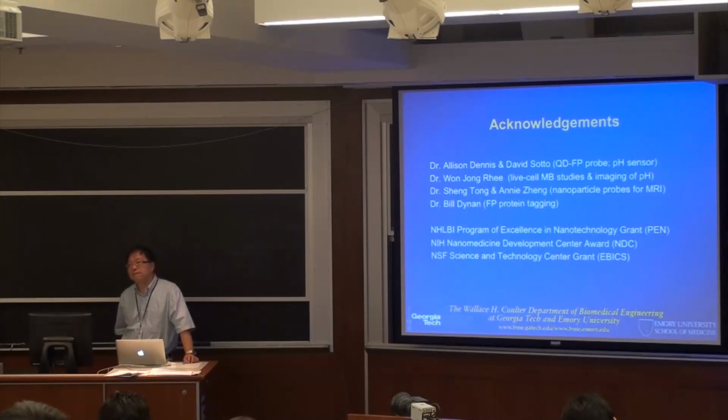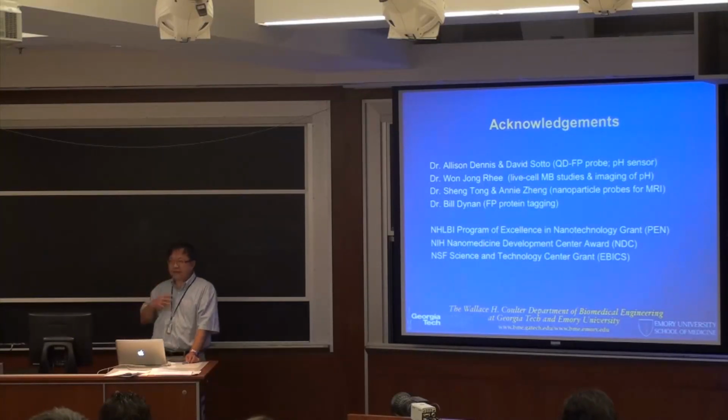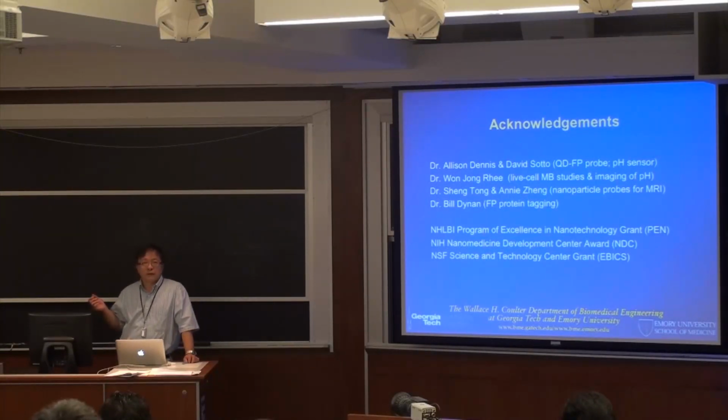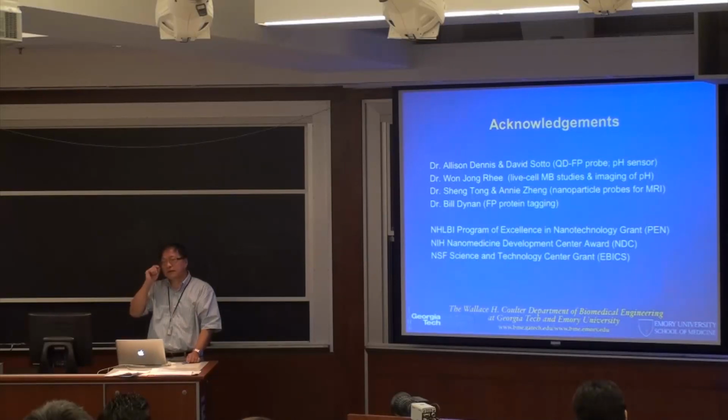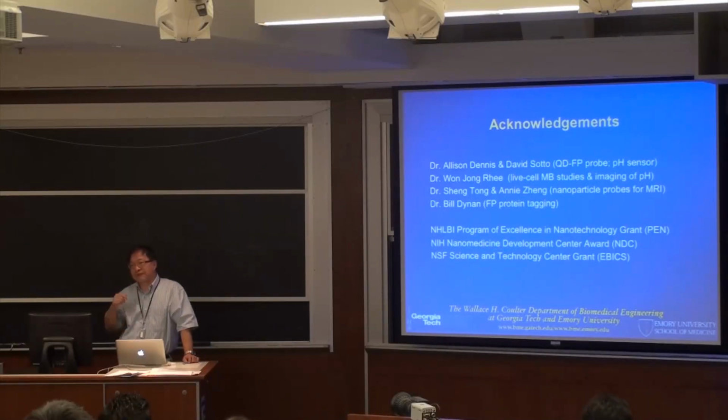Can you do things like alter the exposure time? Yeah, you can use all kinds of tricks optically. For example, some of the microscopes, like the one we use, called DeltaVision, has a very nice engineering to coordinate exposure and taking images to reduce the exposure time, but still get a much better image. So as a way to reduce photobleaching. Yes, indeed.